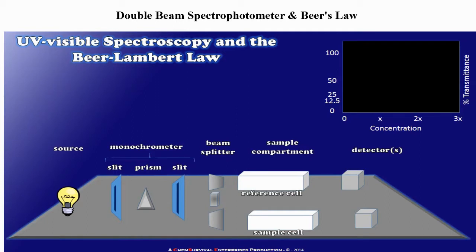Today I'm going to give you a brief introduction to UV visible spectroscopy and the Beer-Lambert law.